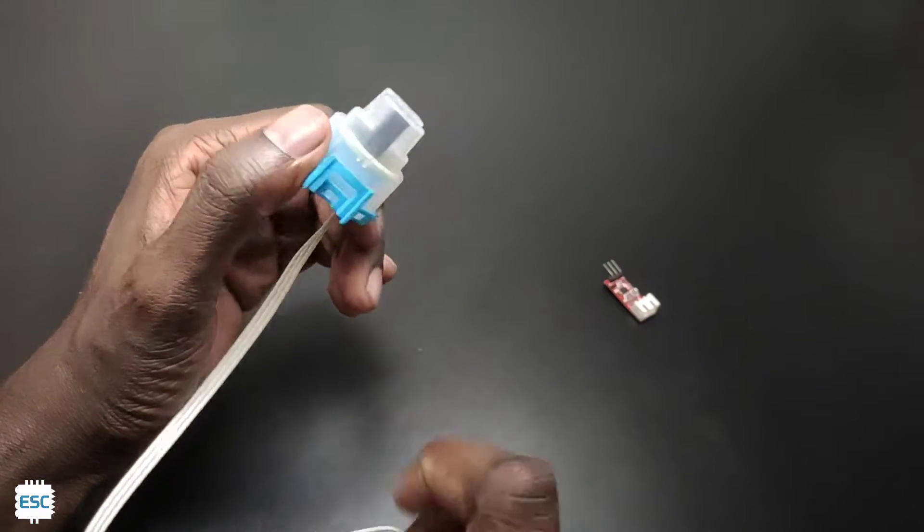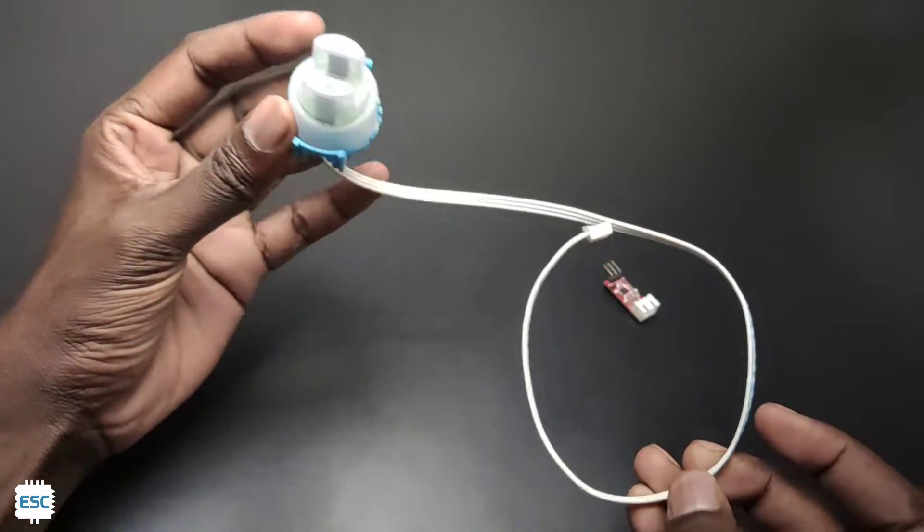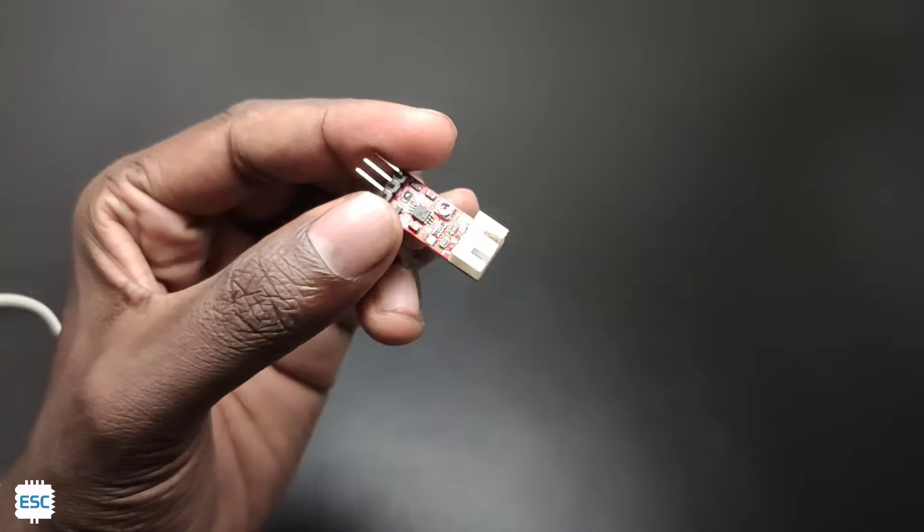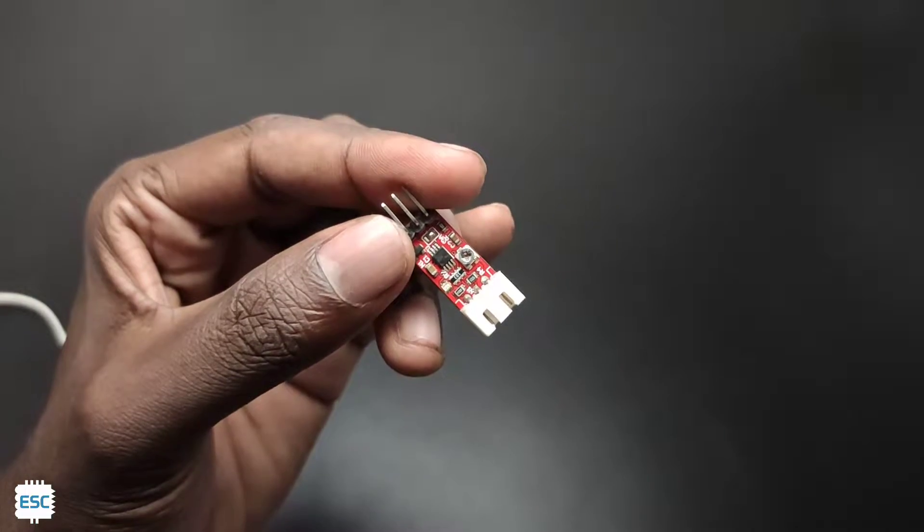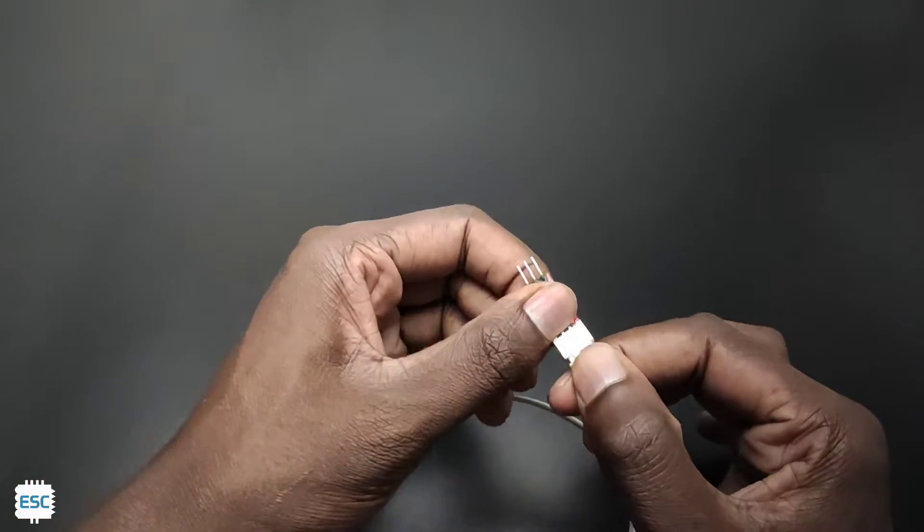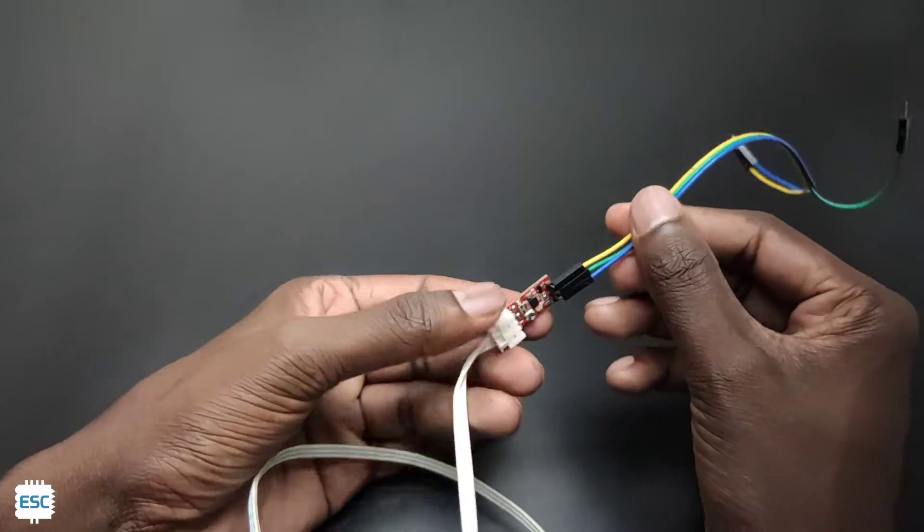So here is the turbidity module and the amplifier. The amplifier has 3 pins, VCC, ground and the output. Working and other details of this module, I explained in a previous video. You can find that video from the I button.